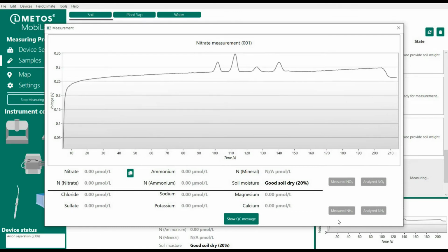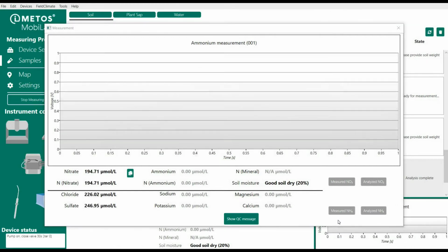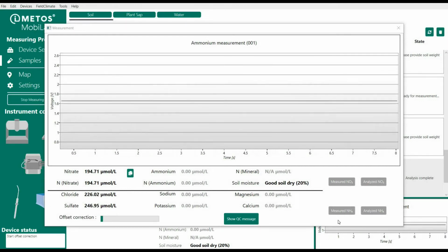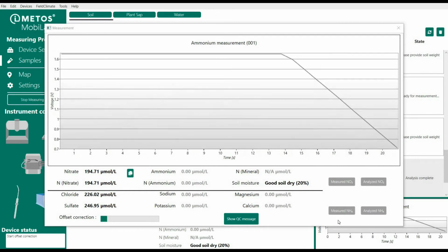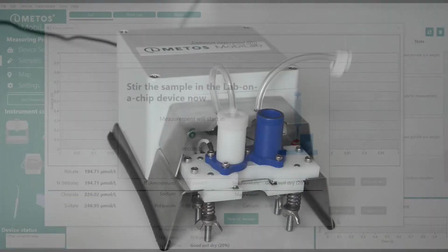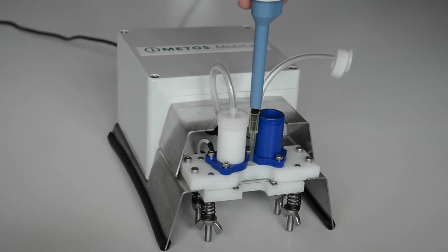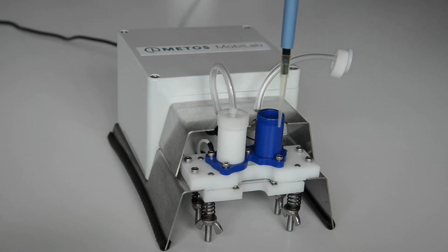The second measurement starts immediately in sequence, if you have activated both. Between the 2 measurements, you must stir the sample hole with the pipette and the same tip that was used before for the injection. Because during the pumping, a run buffer drop forms at the chip inlet of the sample hole. This drop isolates the sample from the chip and must be broken before the measurement. Do this also in the given time window of 10 seconds.